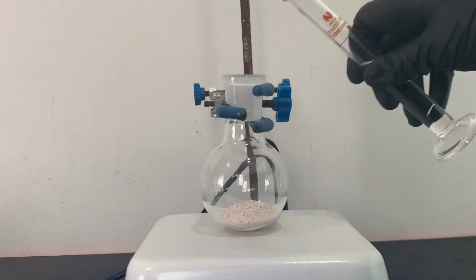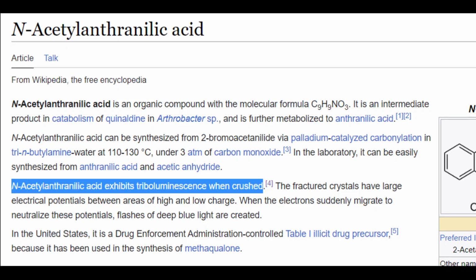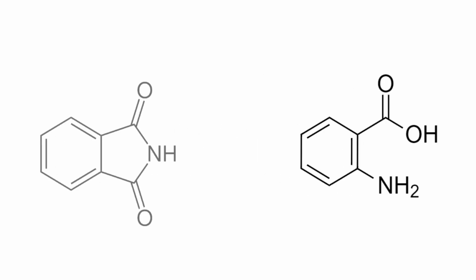In today's video, I am going to be making some N-acetylanthranilic acid. I'm going to be making it because according to Wikipedia, it is a supposedly triboluminescent material. To start the synthesis of N-acetylanthranilic acid, I firstly have to make anthranilic acid from phthalimide.